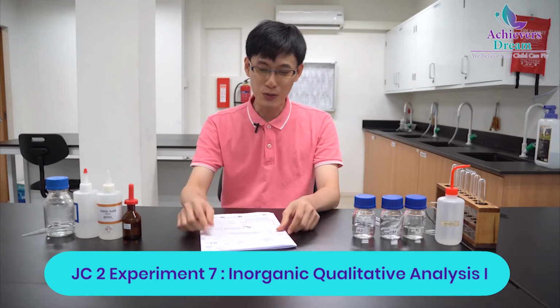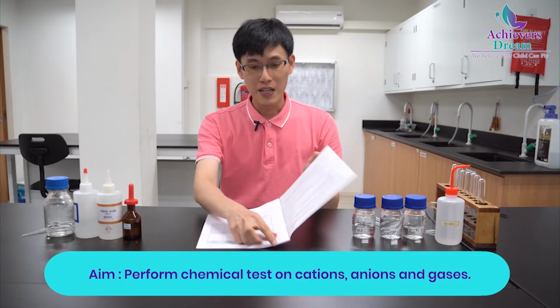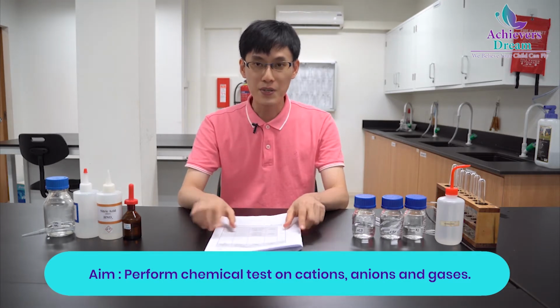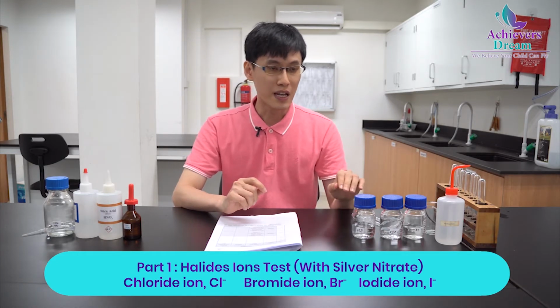Okay, so today we'll be doing experiment 7, which is about inorganic qualitative analysis. The main aim of this experiment is to familiarize ourselves with the various distinguishing tests because most of the compounds have already been given to us. So the first test we'll be doing is the halide ion test.